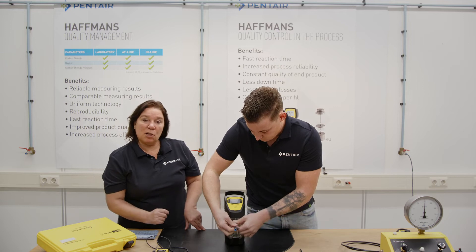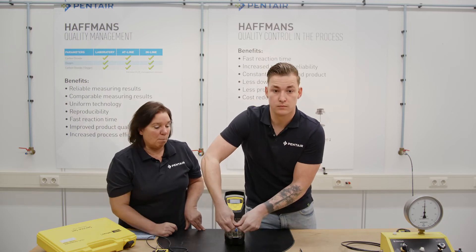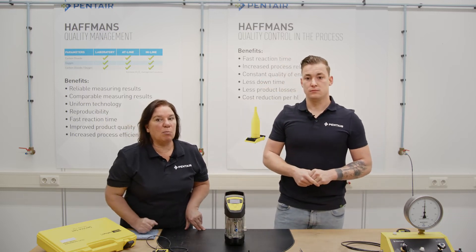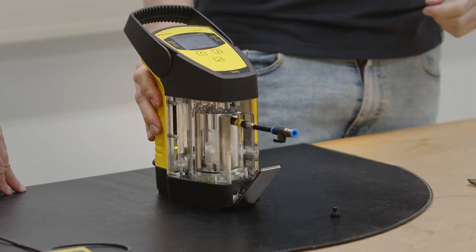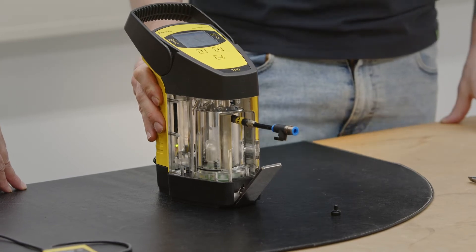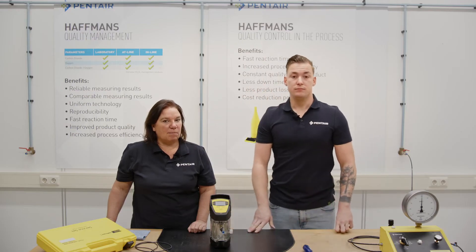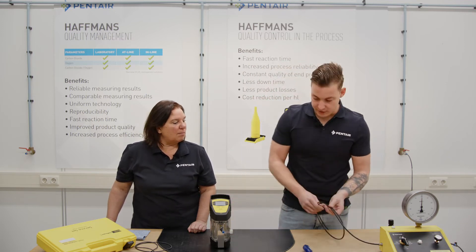We have mounted on the calibration bolt a PVC hose for easy connection to our calibration pressure. Let's check what the pressure reads in the service screen with the handle open — the pressure sensor is open to atmospheric. It reads zero bar, so that's fine. Now I'm closing the handle lever and connecting two bars of pressure on it.